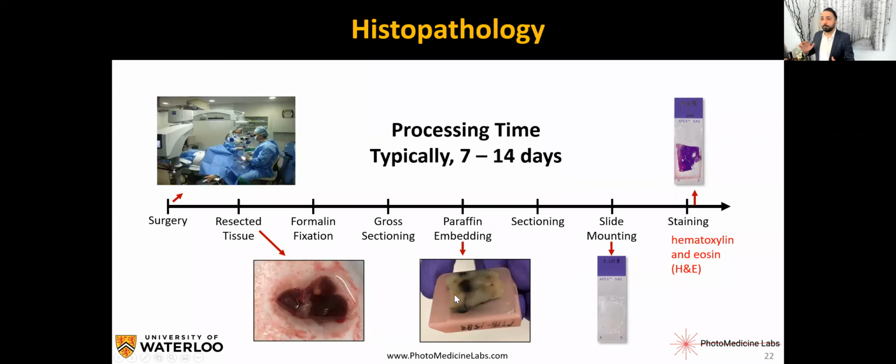And the paraffin molecules will replace the water molecules of the tissue. So you end up with preserved tissue within paraffin wax, so the tissue can last much, much longer. So the idea is we need to shave the surface of this tissue block and put it on a glass slide. And if you put this glass slide under a general microscope, you cannot see anything because, as you can see, the tissue is colorless. So we need to add colors.